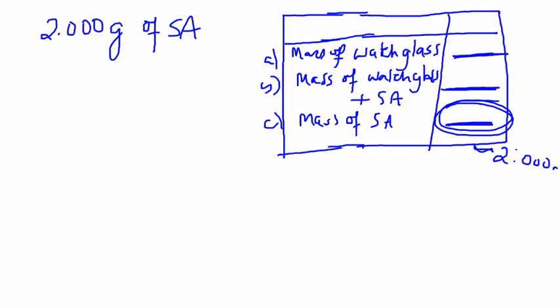This number is what we are saying is going to be approximately close to 2 grams. It doesn't have to be exactly 2.000, could be 2.5, could be 1.5. Your yields are dependent on the moles that you begin with, so don't worry about trying to get it exactly at 2 as long as you know how much you're taking. Now, since this procedure is optimized for 2 grams, the closer you are, so rather than having a 1.5, I would try to keep it 1.8, 1.9-ish or so.